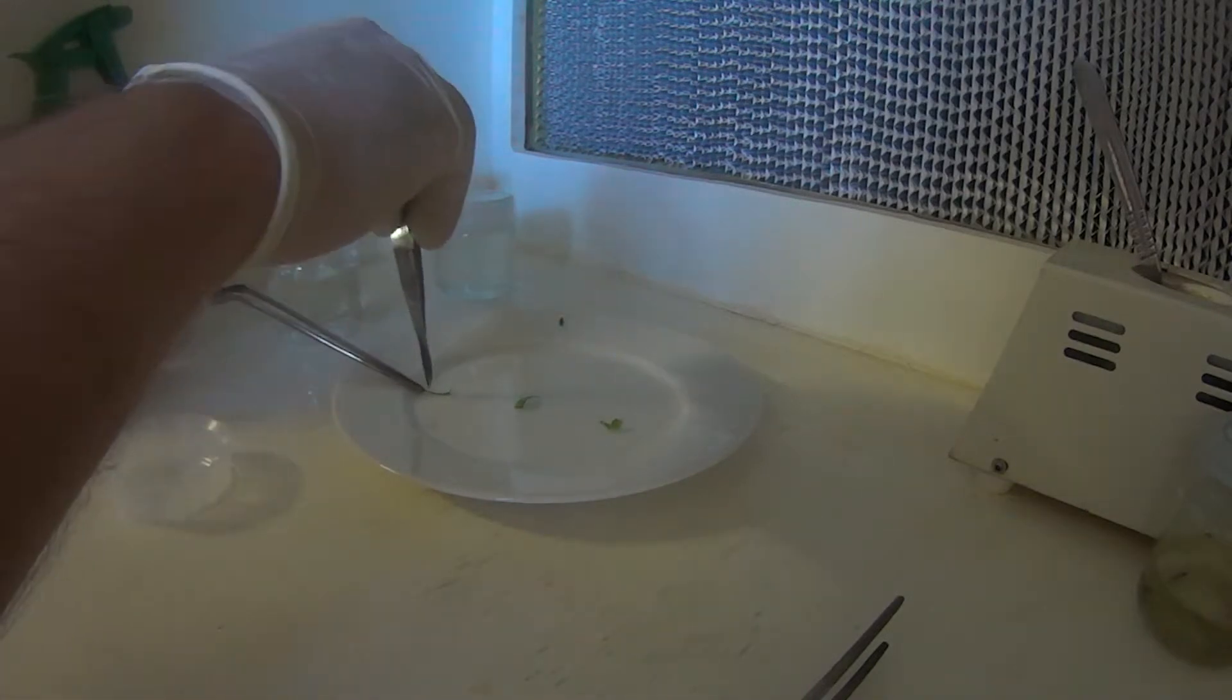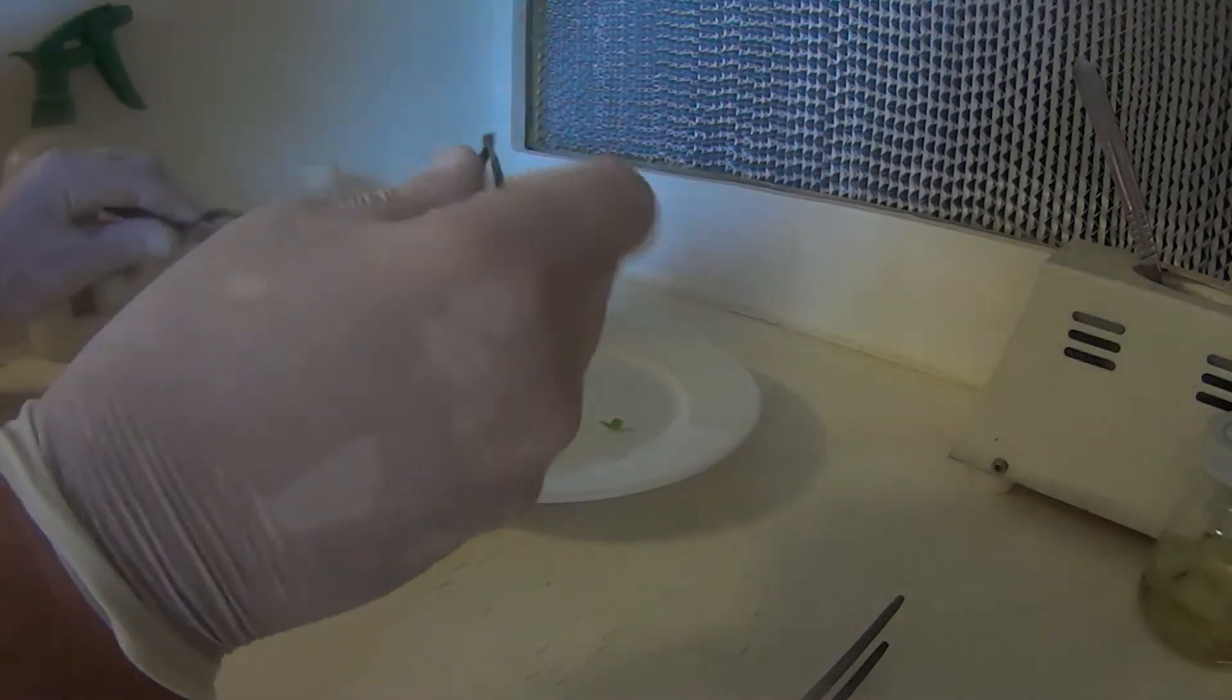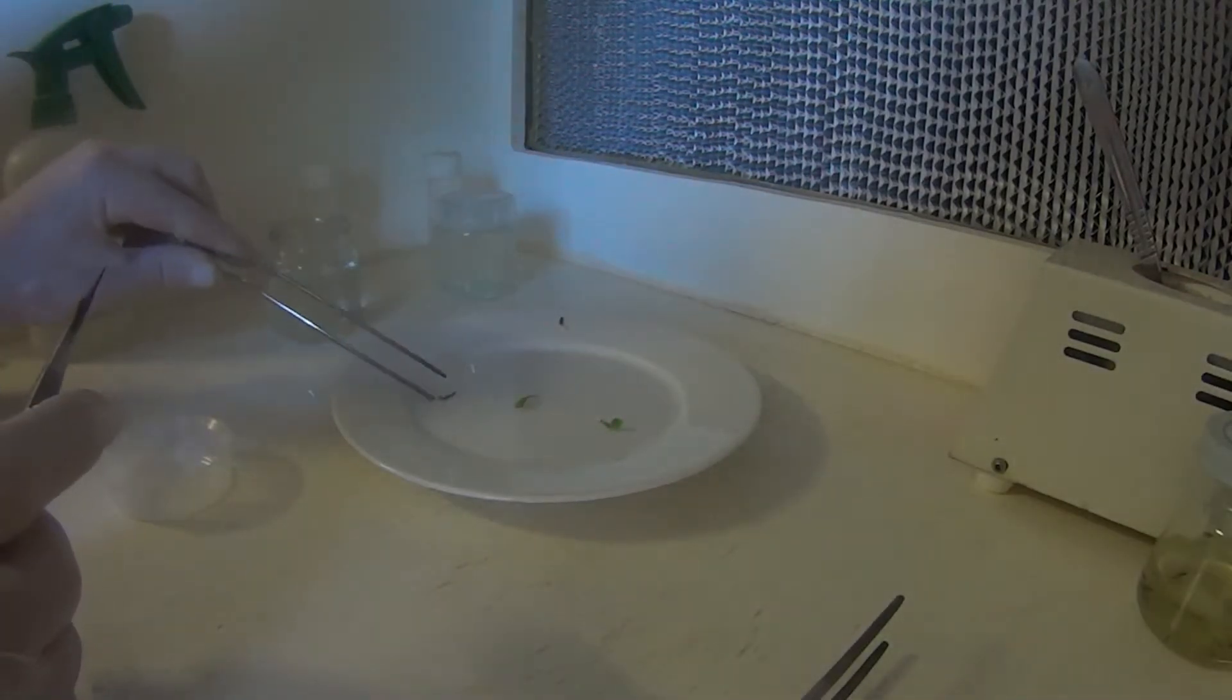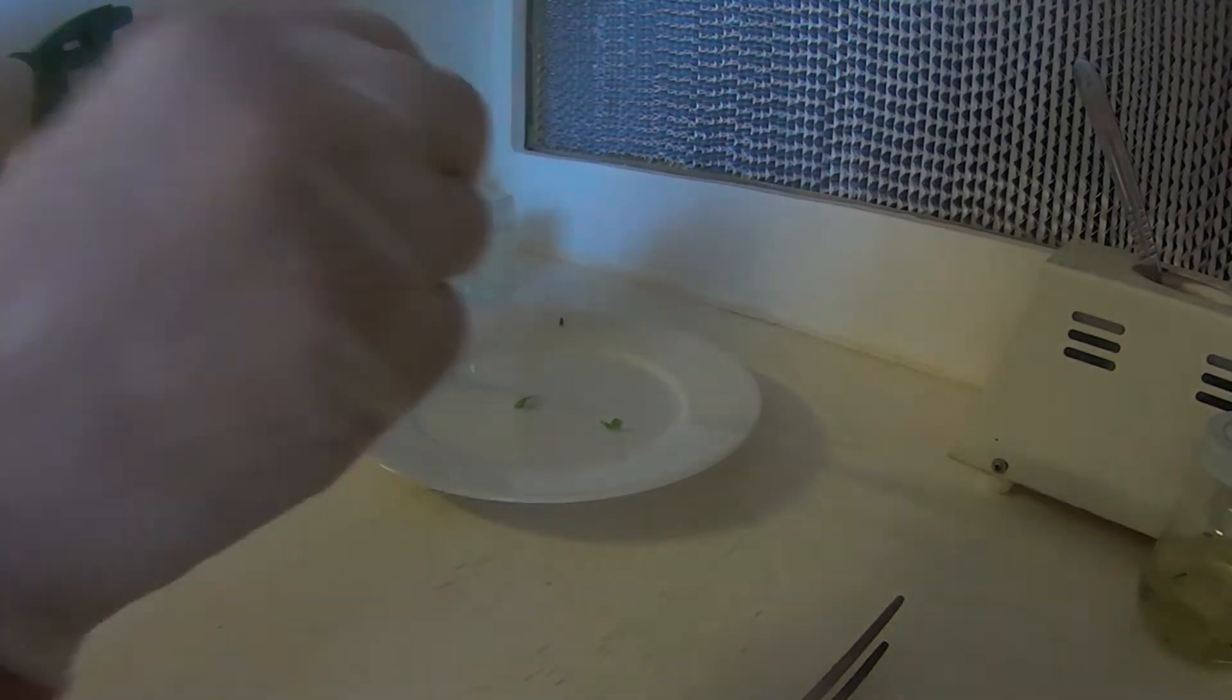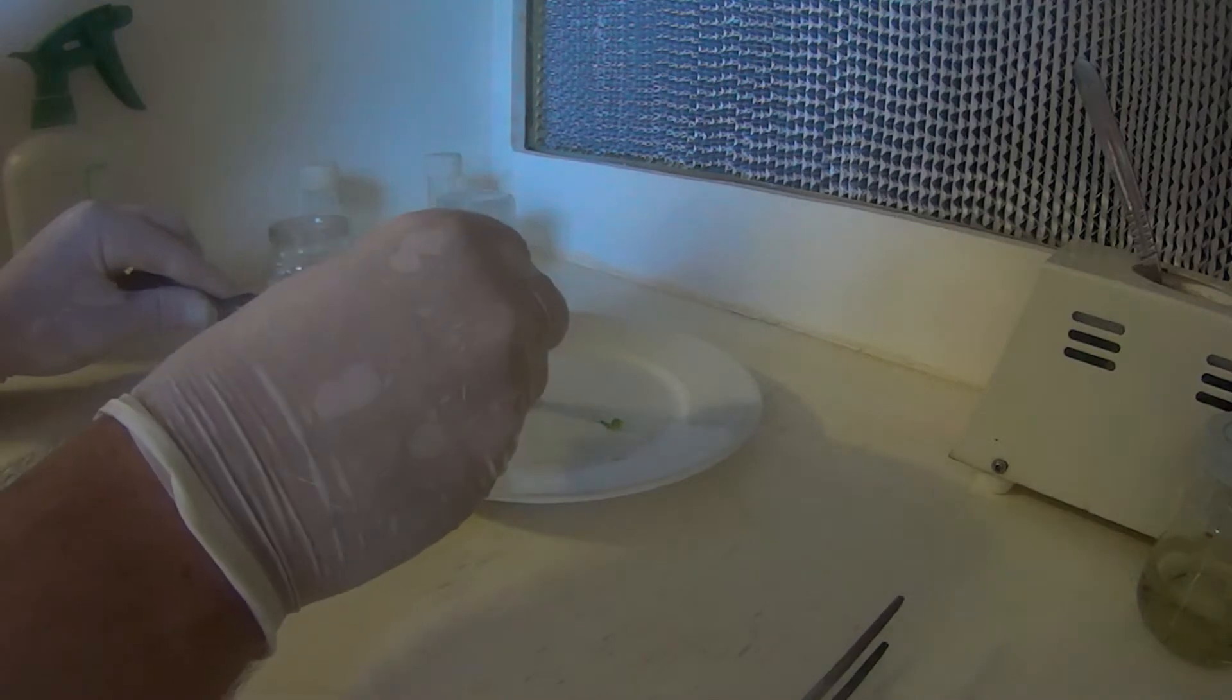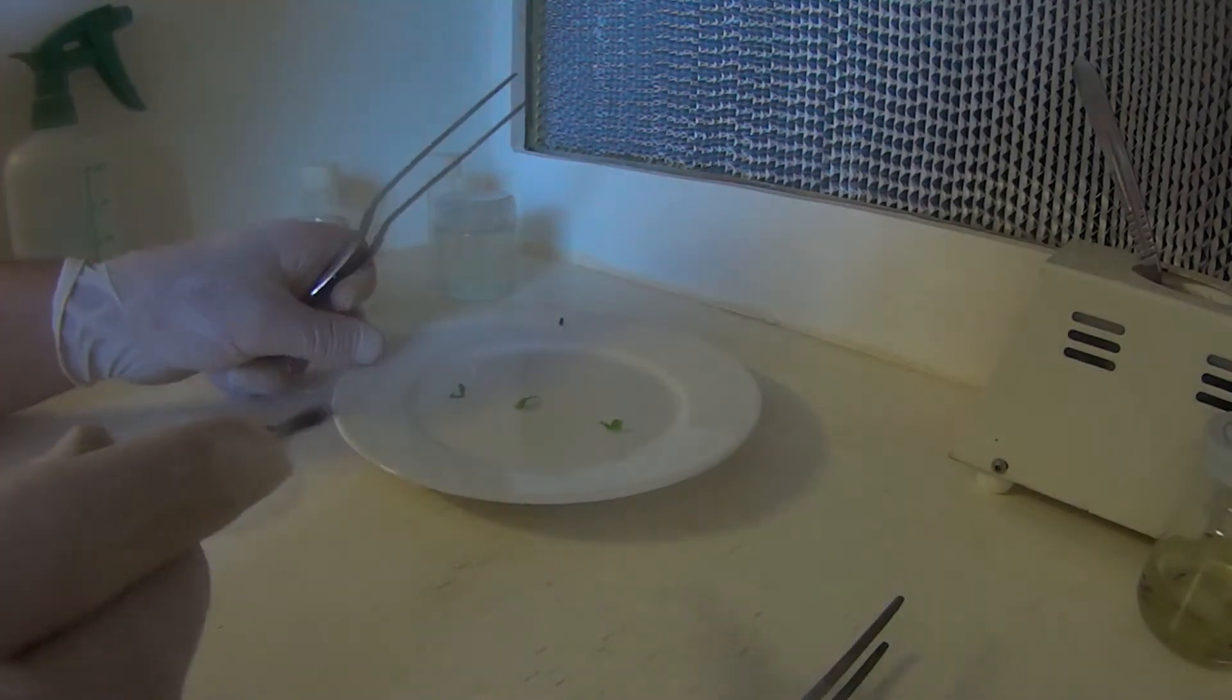Now all we need to do is, like we did with the other plant segments, just trim off the ends. Bleach tends to absorb into the ends, the cuttings of each segment. And the bottom. It's a bit hard to see.